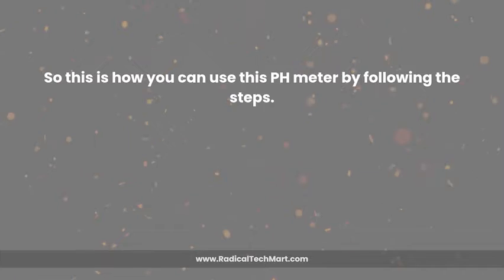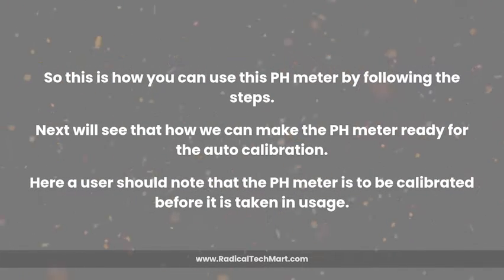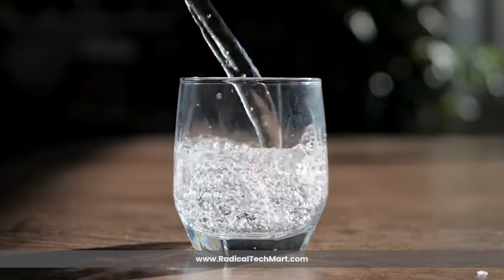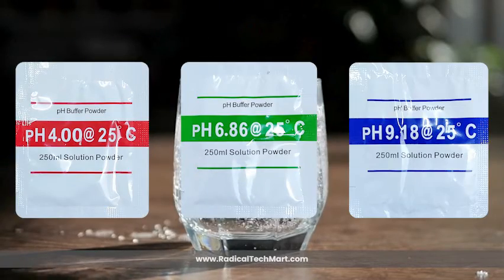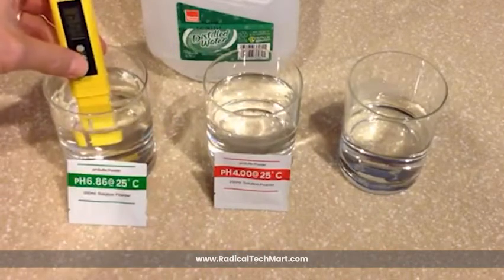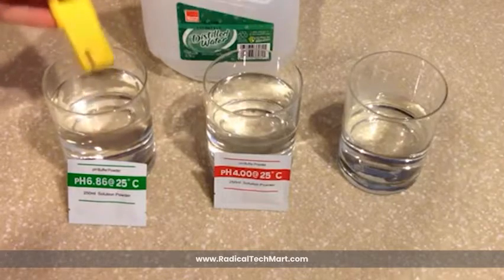Lastly, replace the protective cap to maintain electrode integrity. So this is how you can use this pH meter by following the steps. Next, we'll see how we can make the pH meter ready for auto-calibration. The user should note that the pH meter is to be calibrated before it is taken into usage. First, dissolve each buffer solution in 250 ml of distilled water. Note that the meter comes with three different pouches of 4.00, 6.86, and 9.18 pH buffer solutions. Then turn on the pH meter and immerse the electrode into the pH 6.86 solution at a temperature of 25 degrees Celsius. After that, press the CAL button for 5 seconds and release. The display will start flashing 6.86. Wait until the display stops flashing.